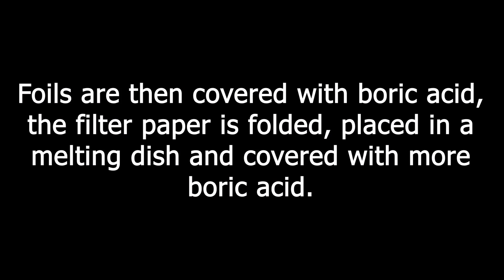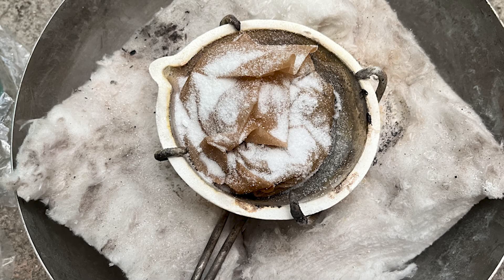Foils are then covered with boric acid, the filter paper is folded, placed in a melting dish and covered with more boric acid. The filter paper is burned slowly and the foils are melted into a button.